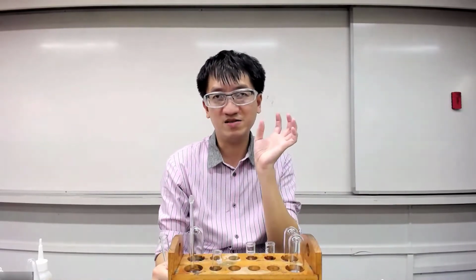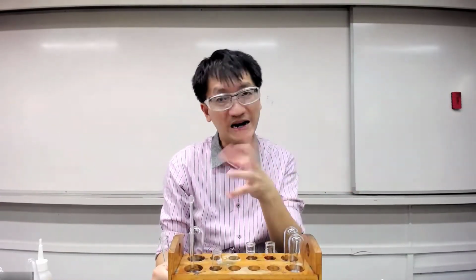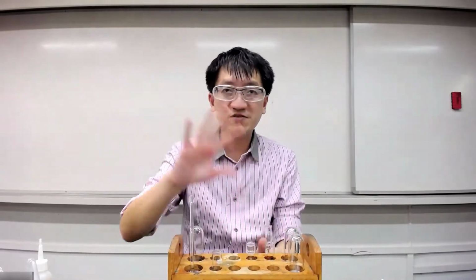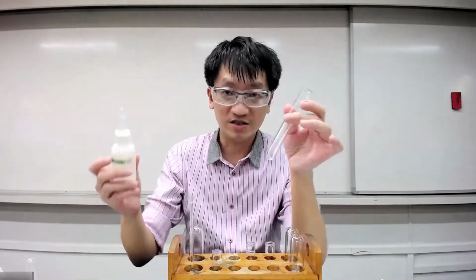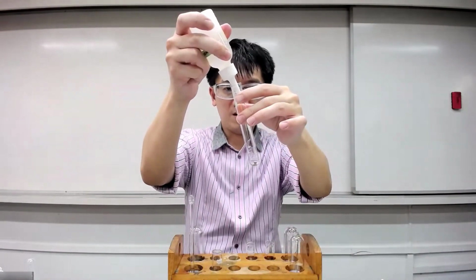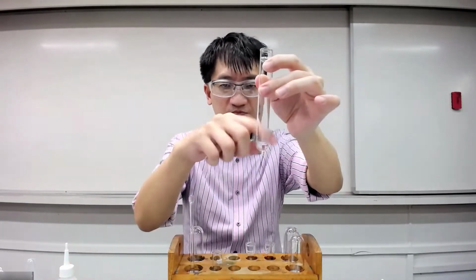So the amount of H+, not a lot of CO2. If we have too much lime water, then we might miss the white PPT formation. So with all these factors in mind, we probably shouldn't be adding too much lime water. So we just add in the lime water, just enough to fill the bottom.